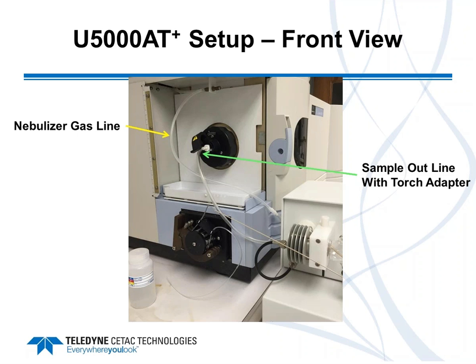In the experiment, we will use the host ICP-AES peristaltic pump, and you see the USN is now in a laboratory cart moved off the bench, so it's in close proximity to that. Of course, samples, you can connect the sample uptake line to an auto sampler if you wish, or if you have a limited number of samples, you can run them manually.